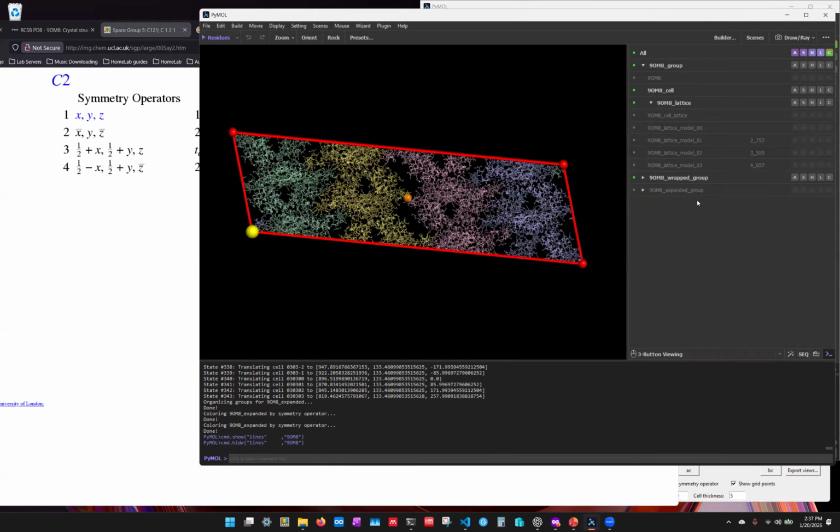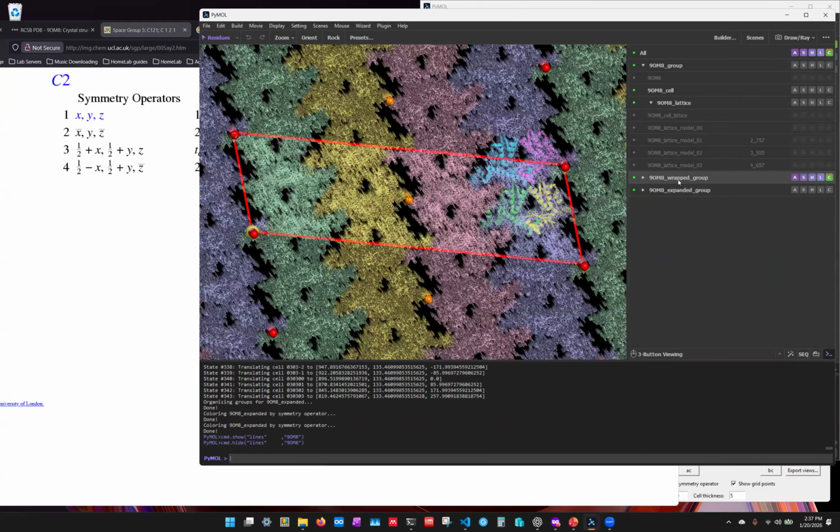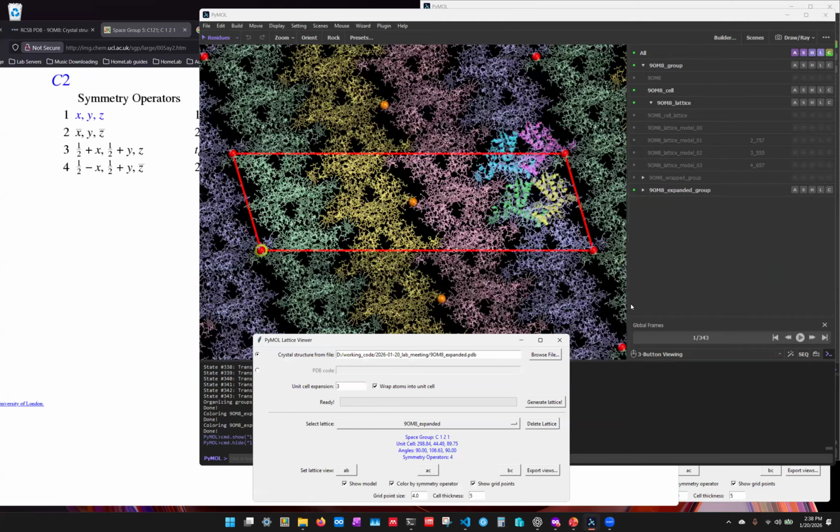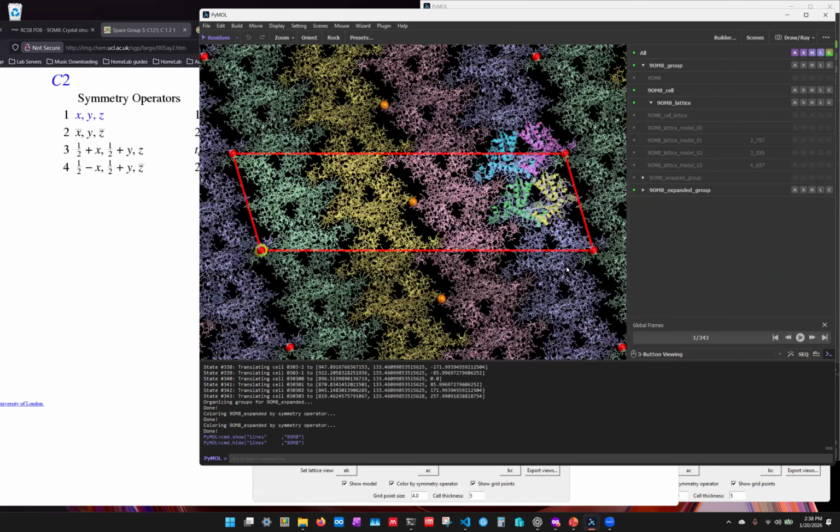Okay, let me jump the gun here, actually. Okay, so you have... This makes so much sense now. Right, so you have the one that's extending out to here, really it's just extending over here. So it's just a different description.